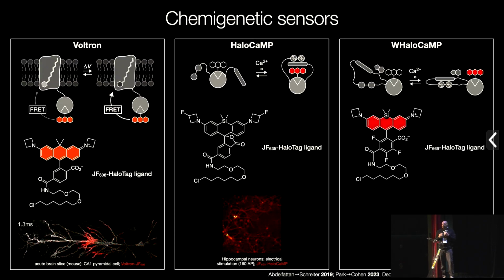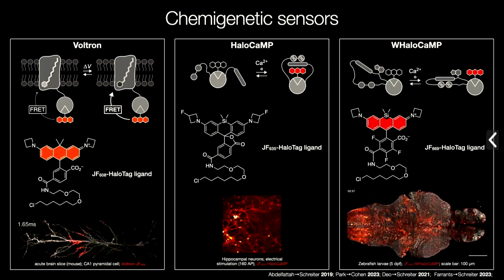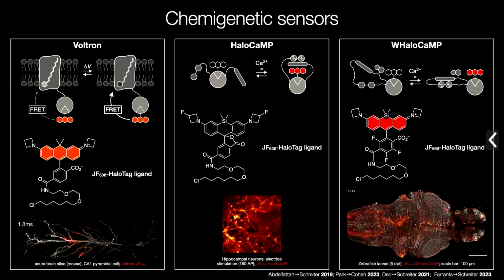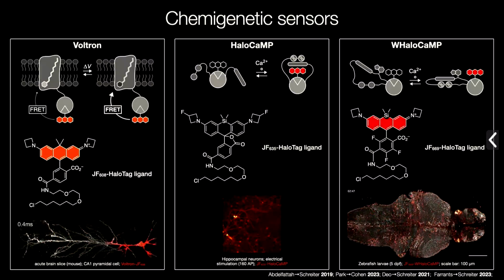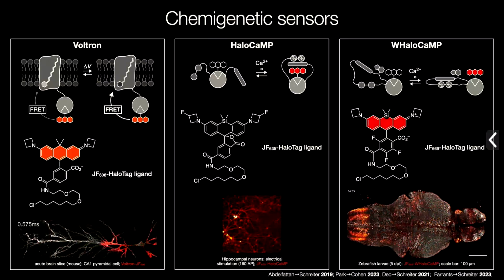And so here you can use any fluorophore you want, including these nicely bioavailable far red fluorophores like this JF669 halo tag ligand. And this is enabling some really cool experiments doing multicolor imaging in animals here in zebrafish, doing brain-wide imaging. And Eric has pioneered 2 or even 3 color functional imaging using this system along with fluorescent protein-based indicators.